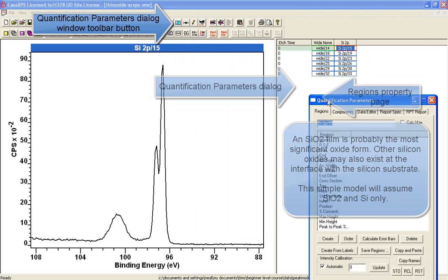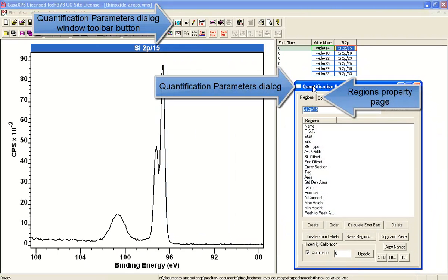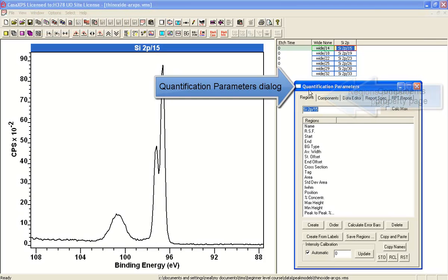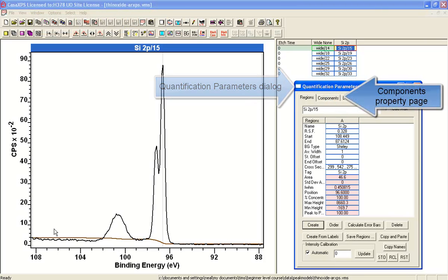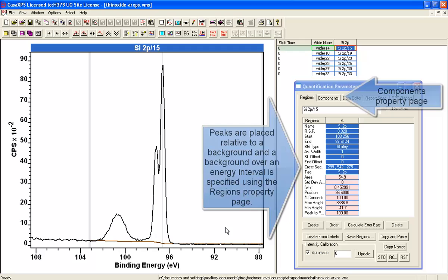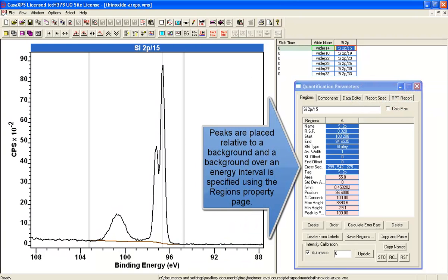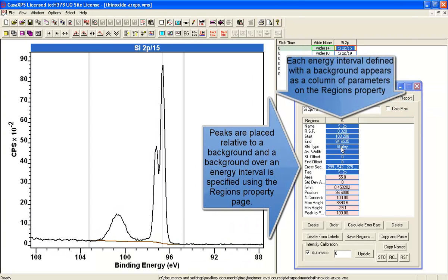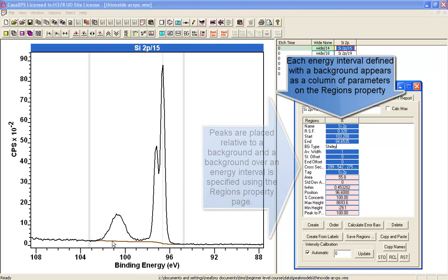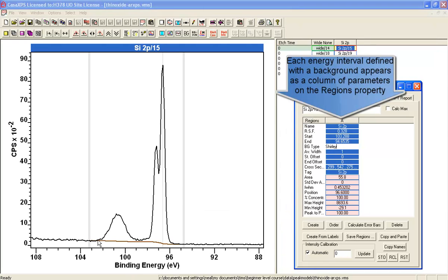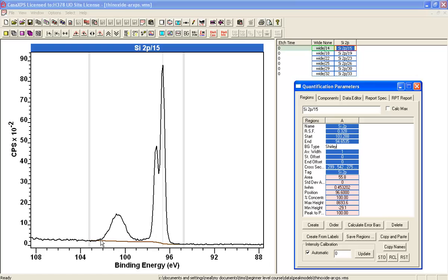The procedure will be as follows. You bring up the quantification parameters dialog window, and the first thing is to create yourself a background. The background has come in, in this case as a default of Shirley, and the peak model in terms of components, component peaks that is, will appear on top of the background.